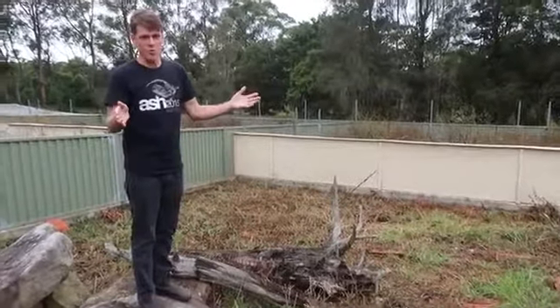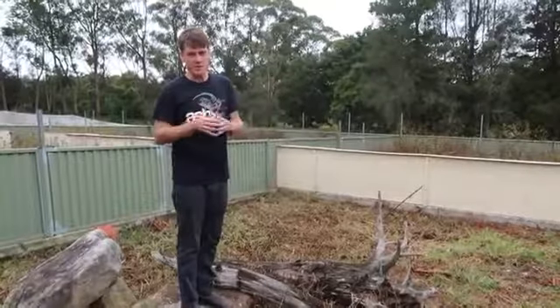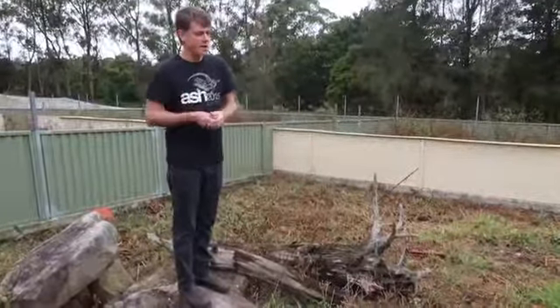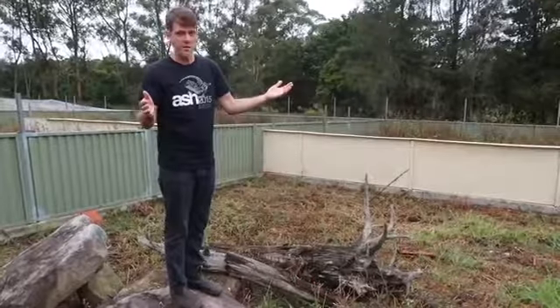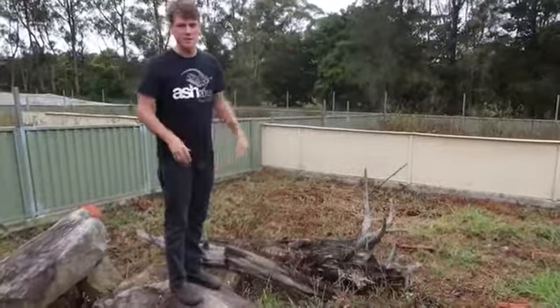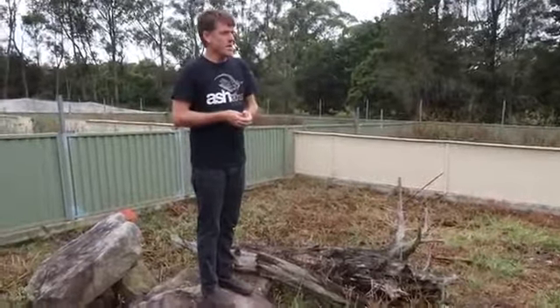have a lot more control over the social interactions that the animals would have and which individuals they would encounter. We can manipulate the number of shelters and resource availability. We can connect the enclosures so we can study dispersal, for example.